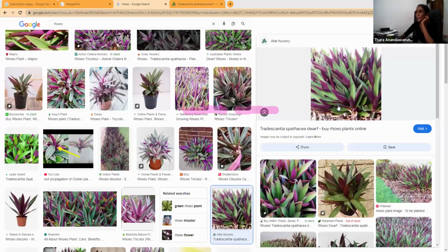It's because of the color of the lower epidermal cells, so that it is easy to observe. There is a vacuolar pigment in the Rhoeo leaf, anthocyanins, which are found in the epidermal cells, lower epidermal cells, especially in the Rhoeo plant.